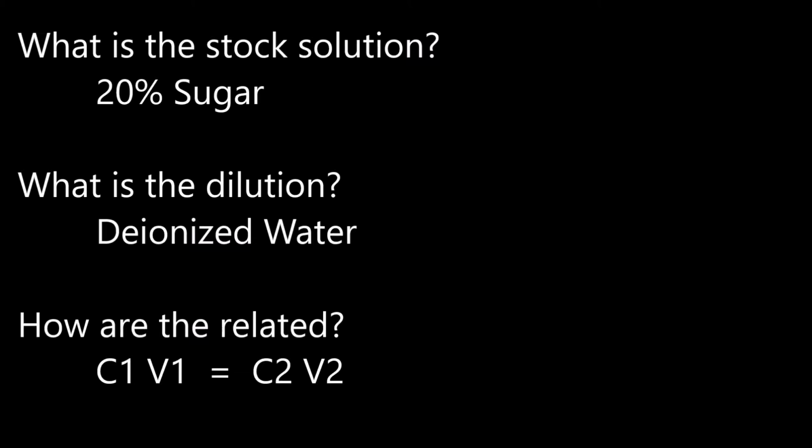Secondly, what is the dilution? In this lab, we will be using deionized water to dilute the stock solution to different concentrations. These two are related by the dilution equation, which is further explained at the end of this video.